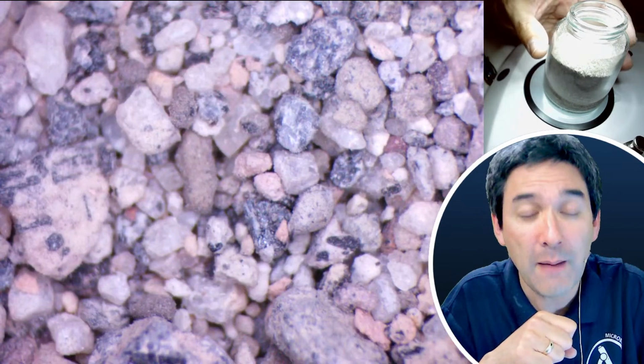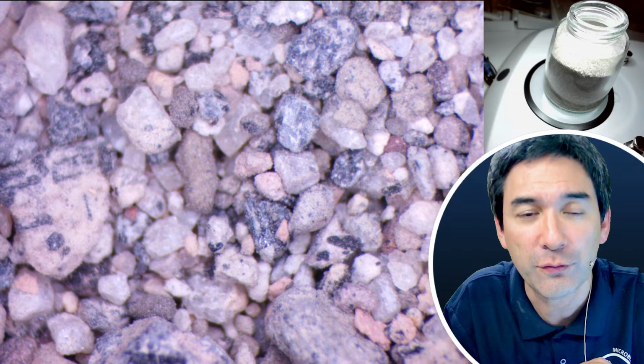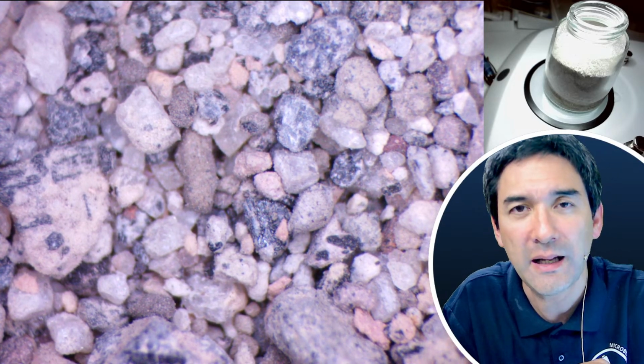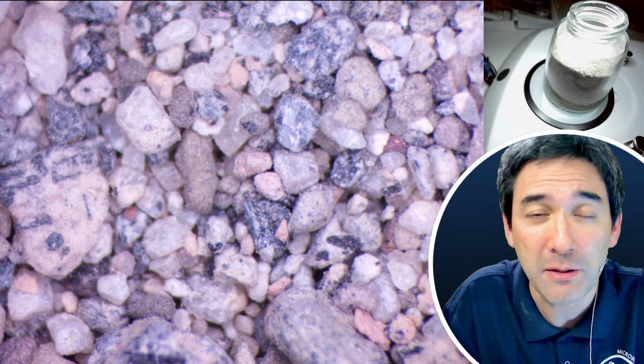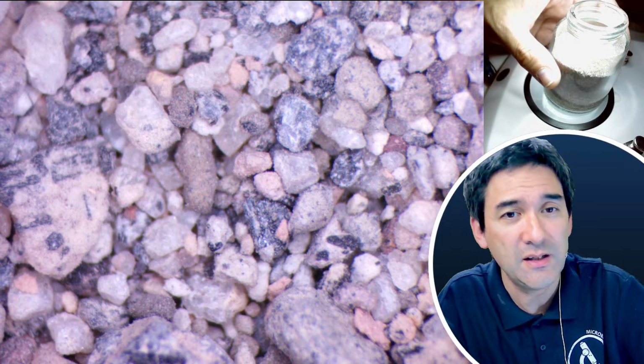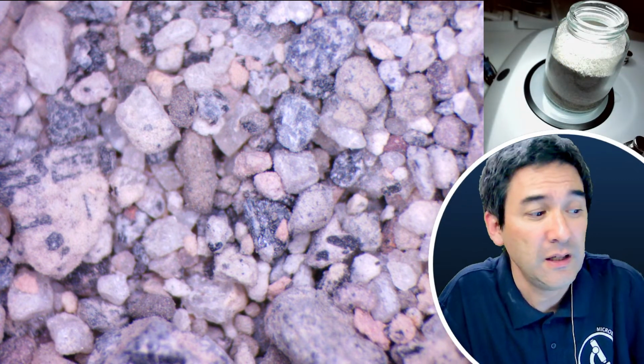However, apparently you cannot be 100% sure that they're actually from outer space, because there are many small spherical metallic particles which are man-made as well. So if you really want to make sure that this comes from outer space, cosmic dust as it's called, then you actually have to do further analysis, which is beyond what most people are able to do.